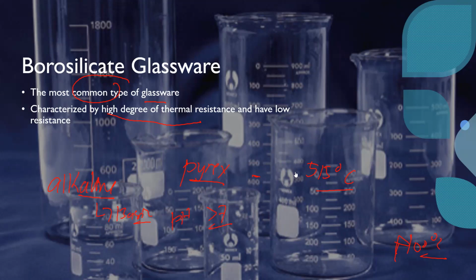Now, there are commercially available borosilicate glasswares, commercial brands, one of which is well known as Pyrex. We also have Corning, Kimax, or Kimble.